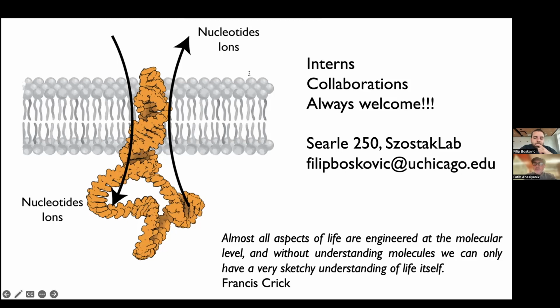Can we use Epi2Me for single cell data analysis? Oof. You can do it for gene expression data, but not for single cell. I think you would need to do as you would for any other single cell transcriptome data analysis, if we're talking about 10x poly A enrichment from single cells. So you will need to do that, not in Epi2Me.